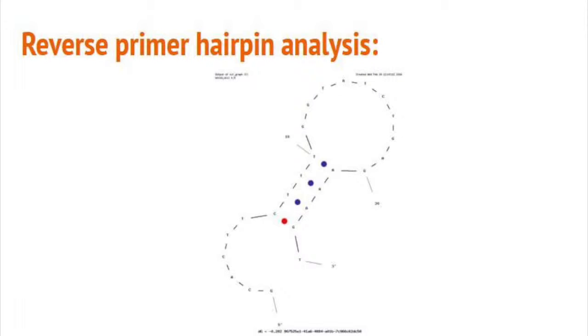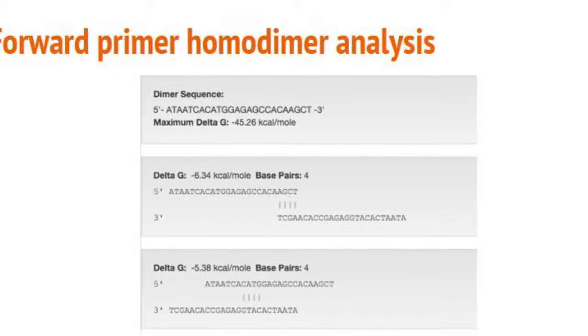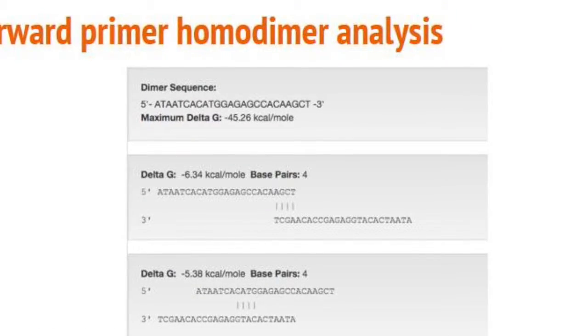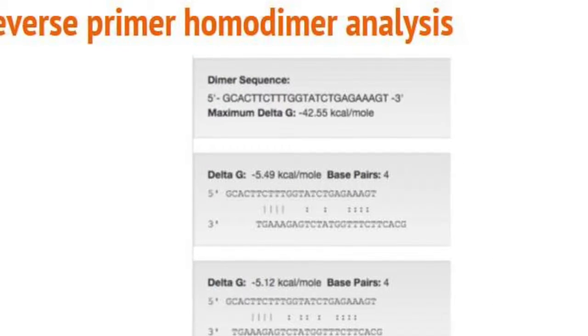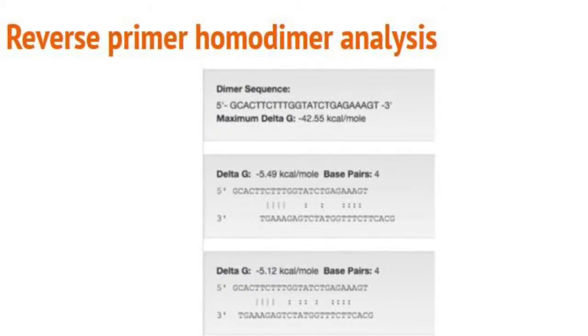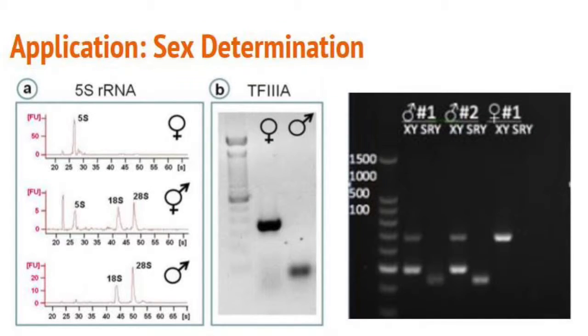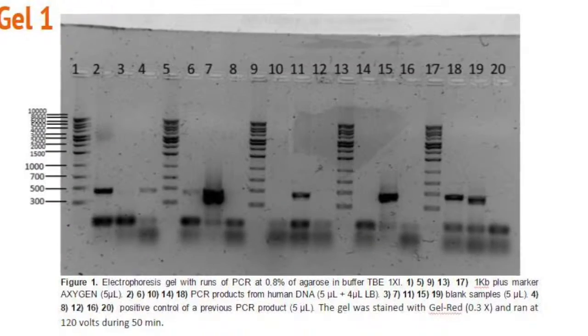The presence of an X-derived fragment serves as a positive control for the amplification and indicates a female origin, while the presence of both this and the shorter Y-derived fragment is a diagnosis for male. Sex determination with blood samples can be applied to areas such as forensic research in the gender determination of a suspect or a victim, and for further DNA analysis to determine identity.